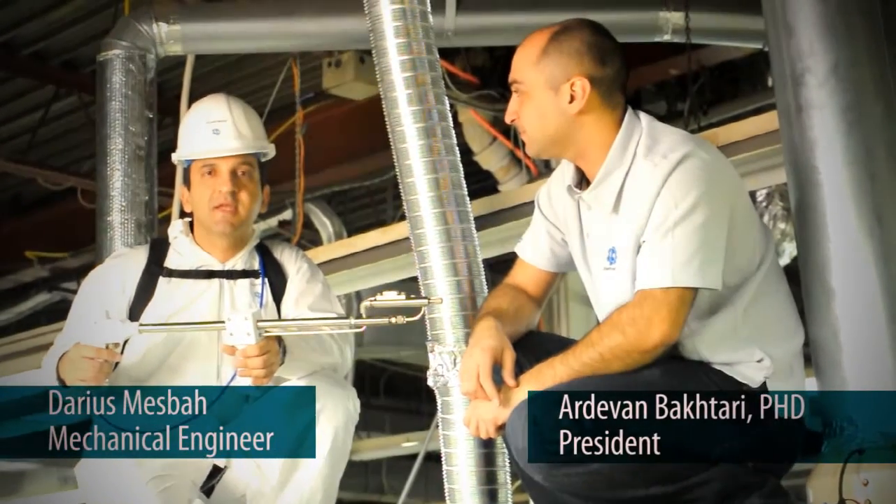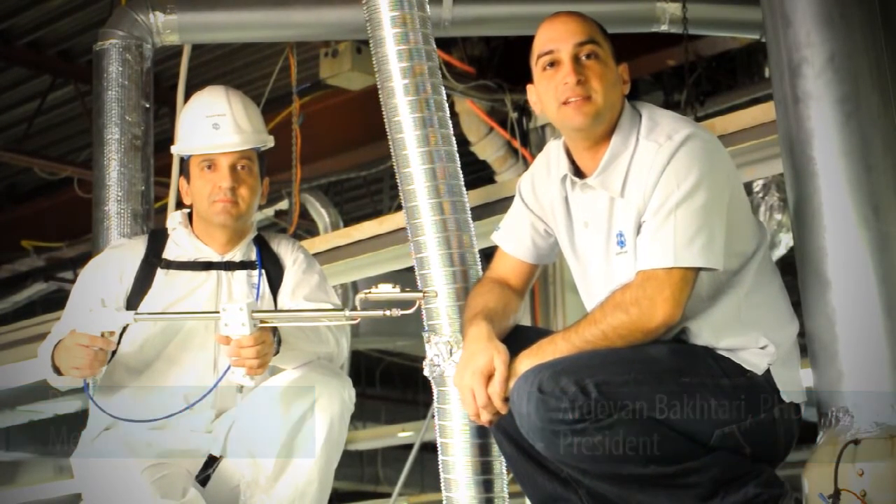Hi, this is Adam. And this is Darius. Today we're going to show you a new product we have, and that's the diluting stack sampler.